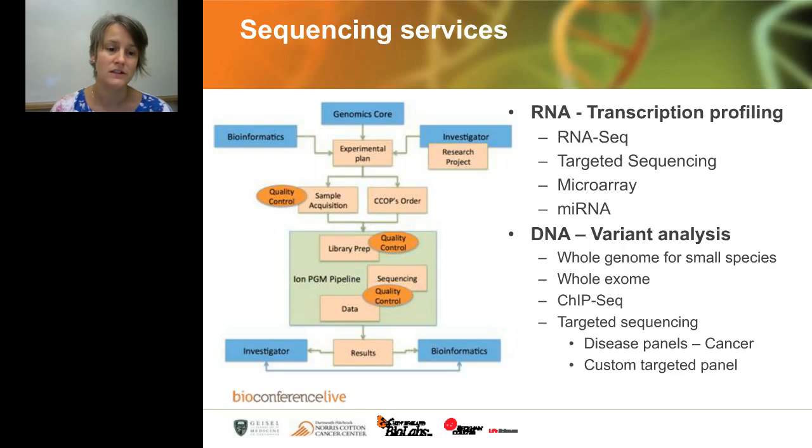We have an internal billing system where customers can place the order. We can also work with external customers as well who may want to do some of the services that we offer, and we can set that system up for them as well. And then once we are satisfied that the sample is high enough quality to go on into the process, we'll go ahead and do the entire workflow and then provide the results to the investigator, and often in association with the bioinformatics core here as well.